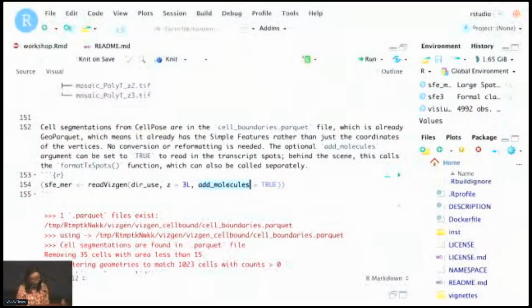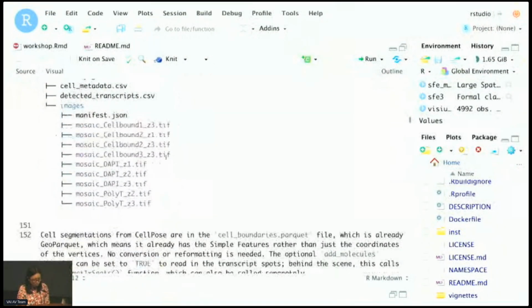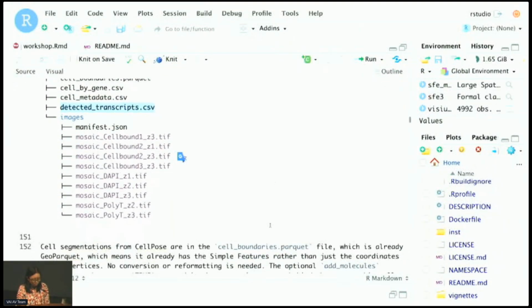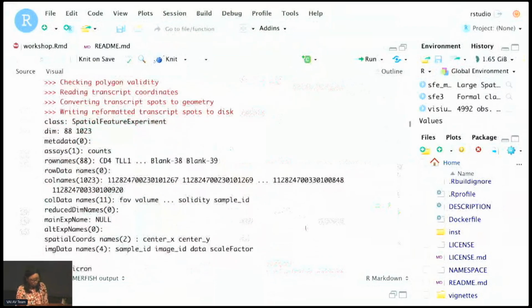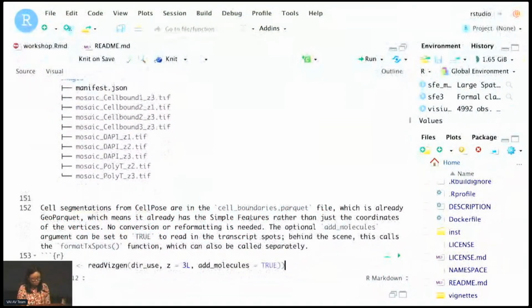And there's the add molecules argument. It's optional, but if you set it to true, the function will process the detect transcripts file, and after processing, the transcripts will be added to the SFE object.